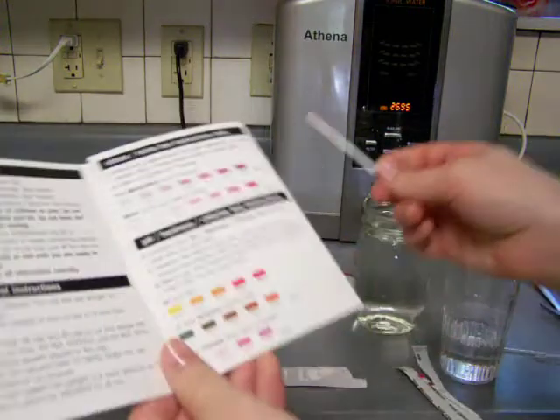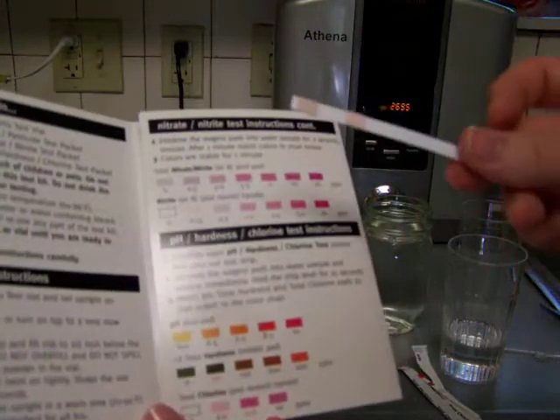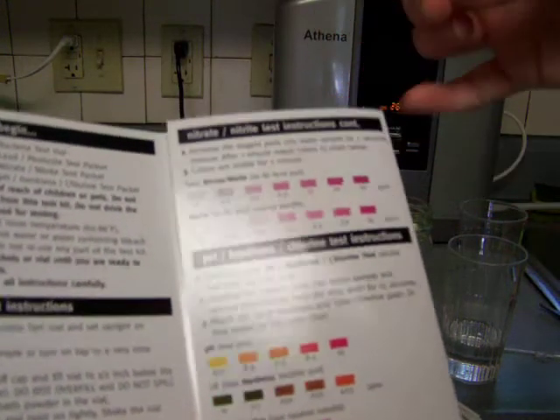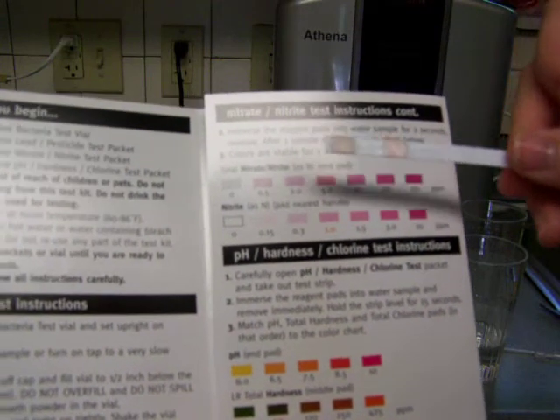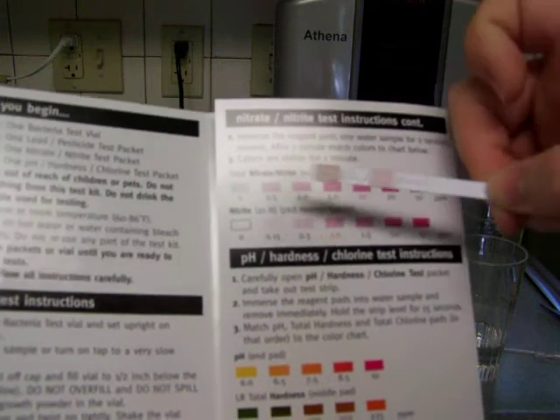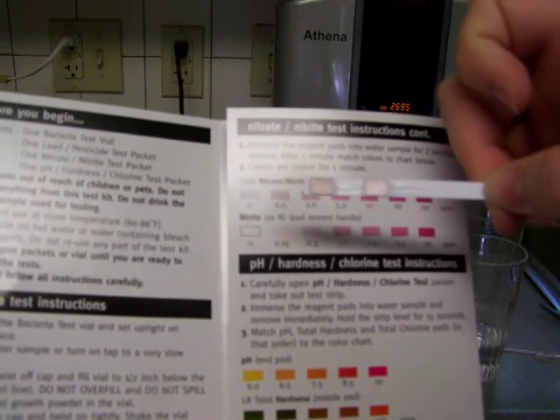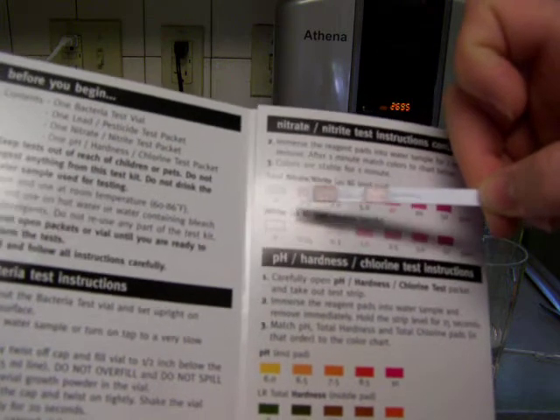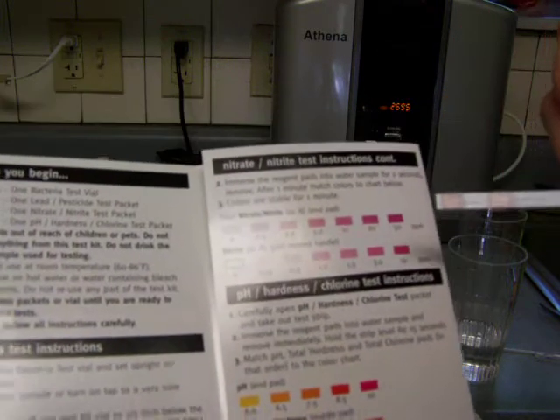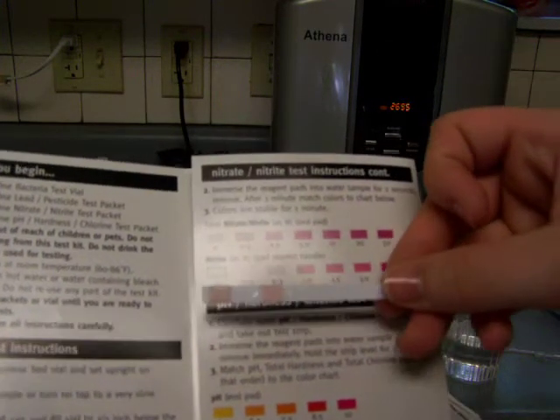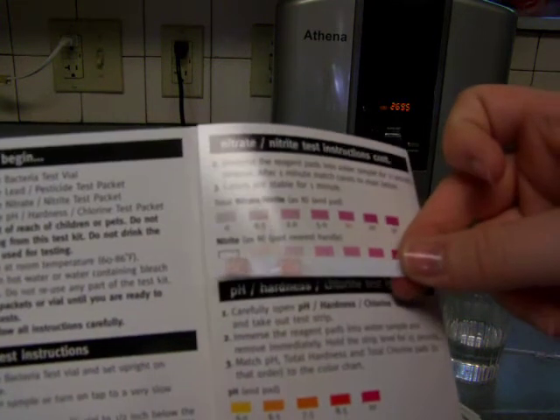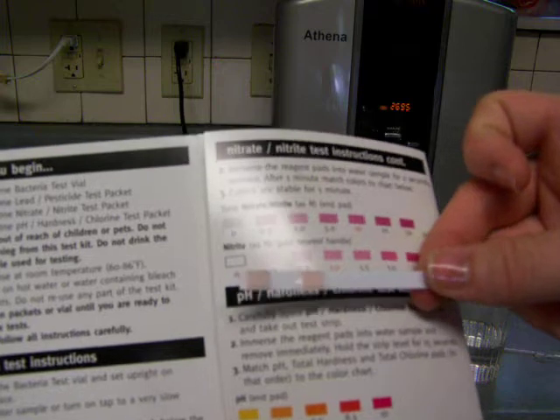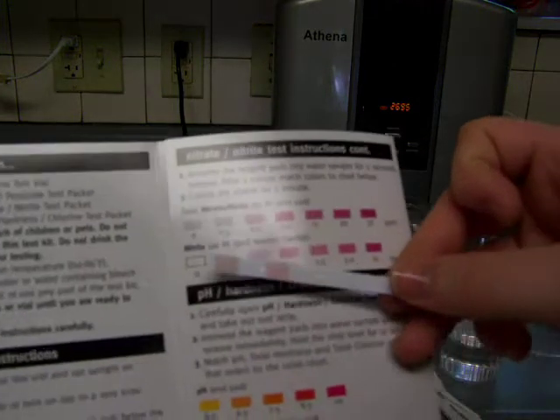And then this one. Let's look. Back here is the nitrate nitrite. So this pad is the nitrate. And it looks like a 0.5 parts per million, which is not bad. And then this one, the one on the right, looks a little bit more pink, like between a 0.15 and 0.3 parts per million. That's nitrite.